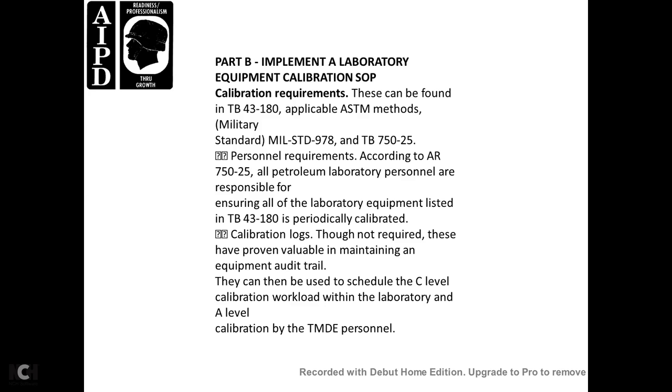Part B, implementing the laboratory equipment calibration standard operating procedure. Calibration requirements may be found in Technical Bulletin 43-180, with applicable ASTM methods, Military Standard 978, and Technical Bulletin 750-25. Personnel requirements: according to Army Regulation 750-25, the petroleum laboratory personnel are responsible for ensuring the laboratory equipment listed in Technical Bulletin 43-180 is periodically calibrated.